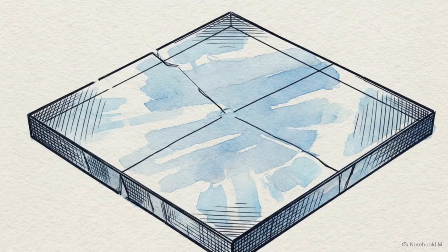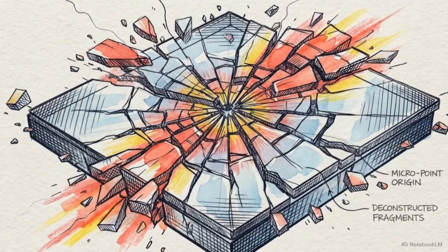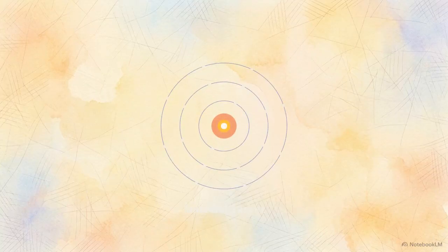When a highly engineered material under stress finally shatters, examining the broken pieces by eye won't tell you why it failed. A surface-level inspection can only show you where the break happened, not the microscopic weakness that caused it. To understand the root cause of a failure, material scientists have to look much deeper. They have to interrogate the material down at the quantum level. Their primary tool for this interrogation is the X-ray.